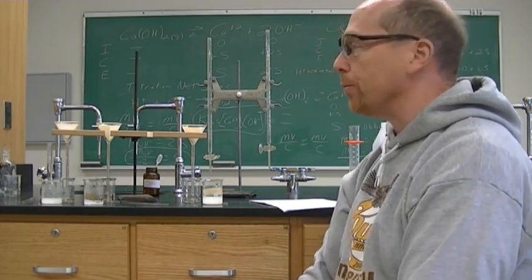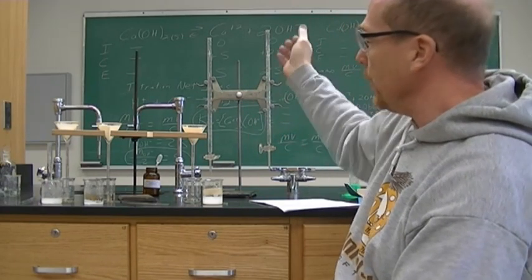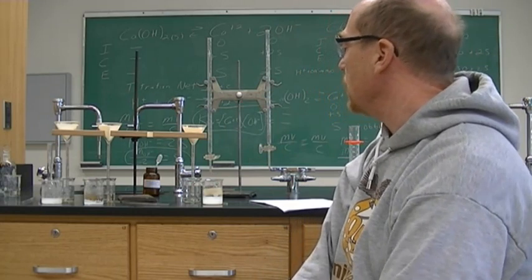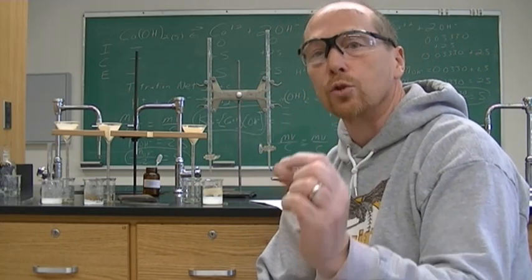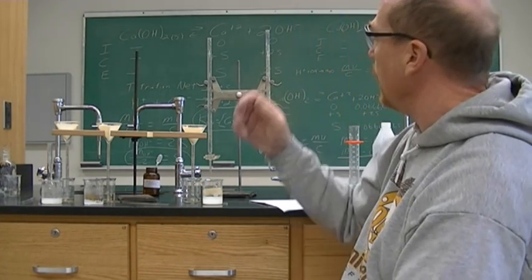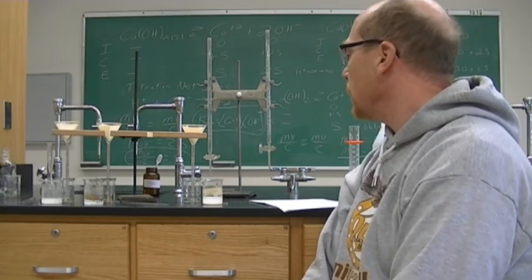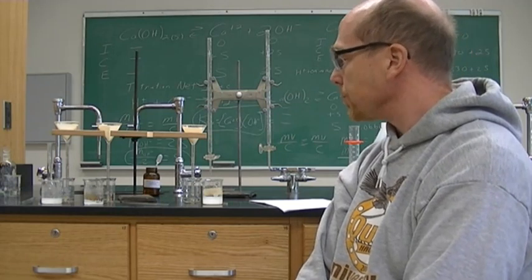All right, so I prefer to have it as two liquids that are in a burette so that I can do a back titration if I did not see the color change from a pink to colorless in one drop. If I did, then I'm good. If not, I will have the opportunity to do a back titration. All right, so I will probably do this both ways.